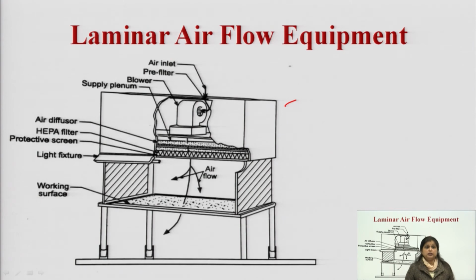Always in grade A, which is also known as the aseptic area, this is a special type of cabinet having HEPA filters. HEPA filters are always there within that unit, and those HEPA filters are there to remove microorganisms and air dust particles.